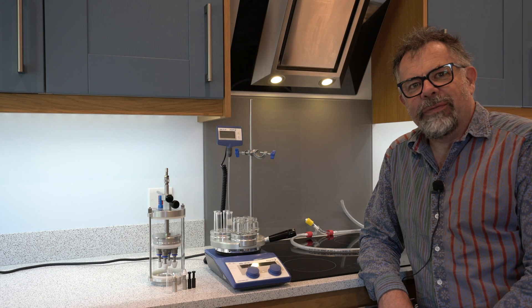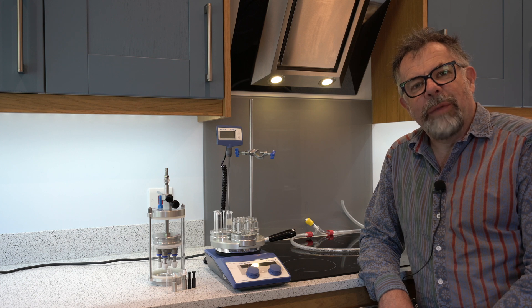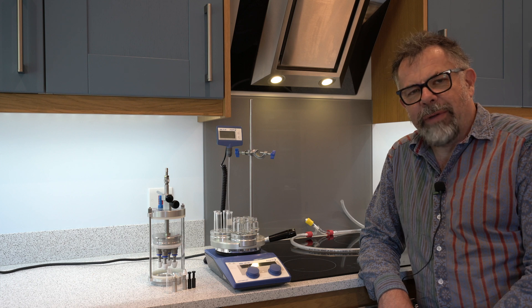Welcome to Asynt. My name's Martin Fordham and today I'd like to introduce you to a parallel evaporator that's quite unique. This is the DrySyn Spiral Evaporator.